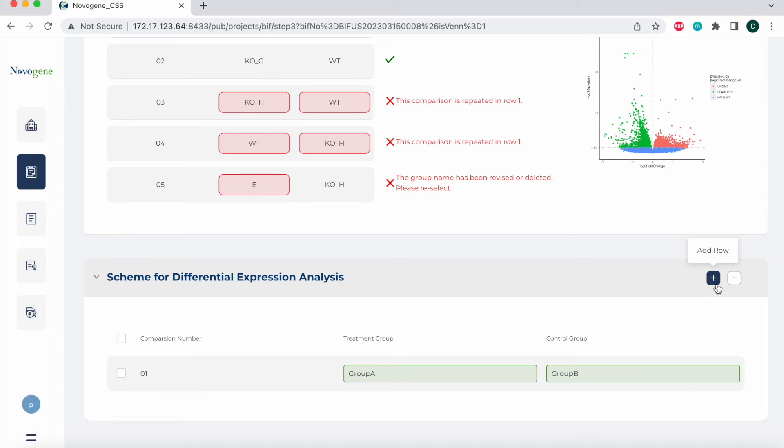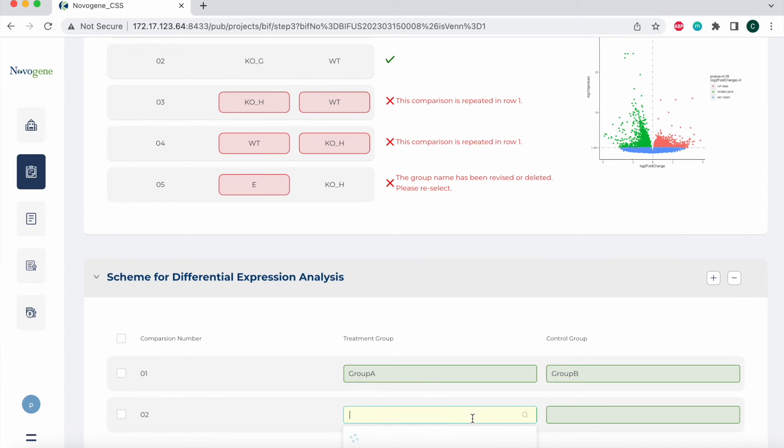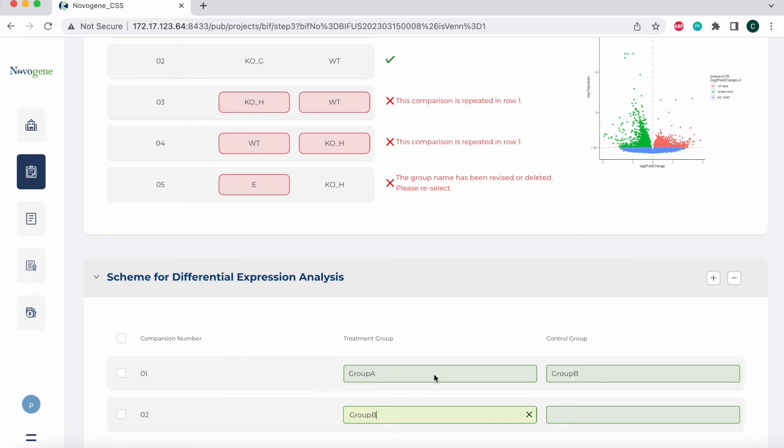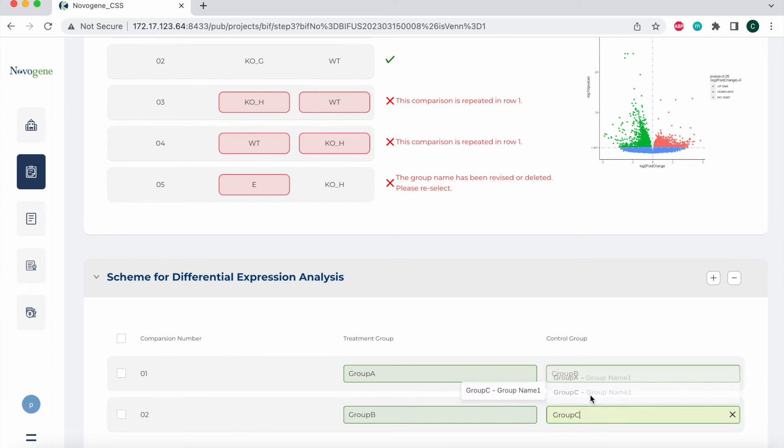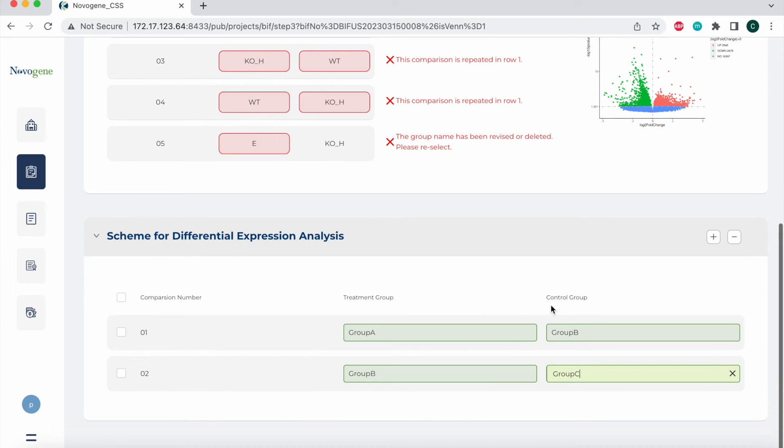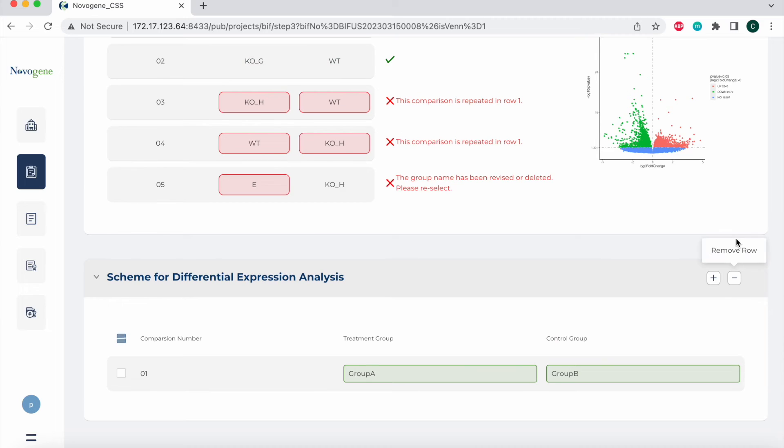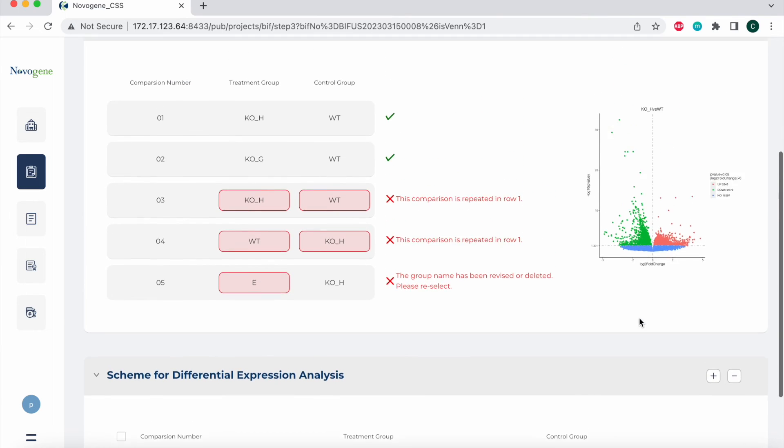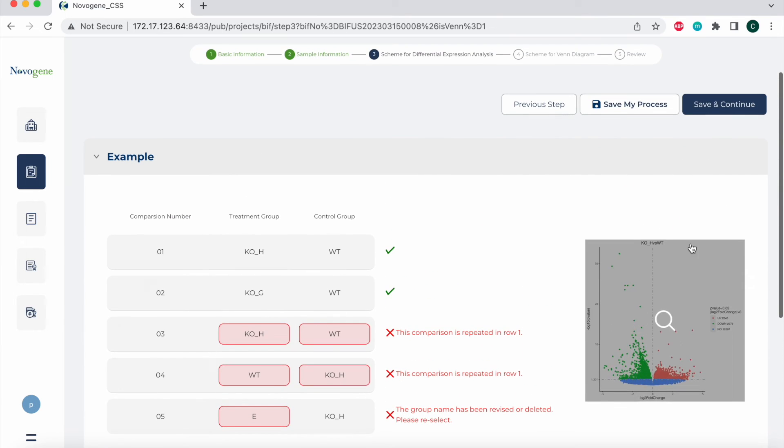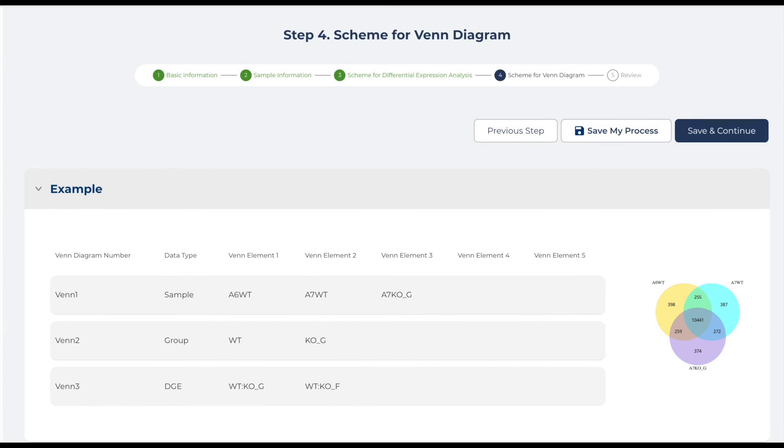If I want to add another one, I'm going to do the same thing. In this case, I'm going to use group B as a treatment group and group C as a control group. If I wanted to delete this for whatever reason, I would just click on this box and hit the subtract button. Once you are done, save this page and continue to move on to the next section, which is the scheme for Venn diagram.